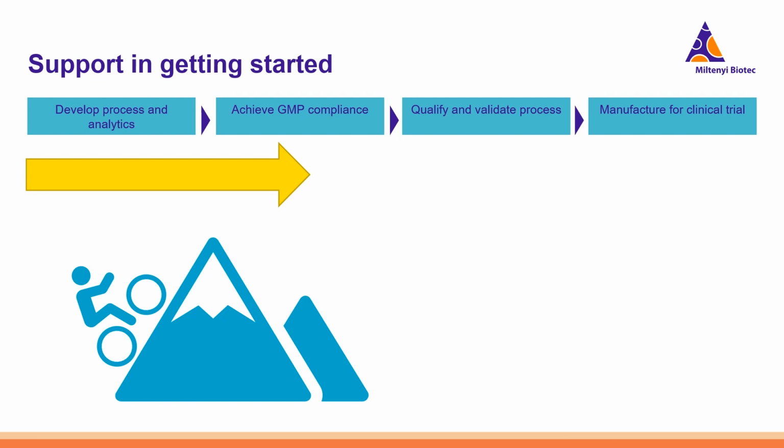However, many clinicians are still interested in providing cell therapies to their patients. And I will now introduce to you a shortcut that we developed to help people get through these development and also many of the achieving GMP compliance steps in order to be able to start as soon as possible qualifying and validating the process in order to be able to provide manufactured cells for a clinical trial.